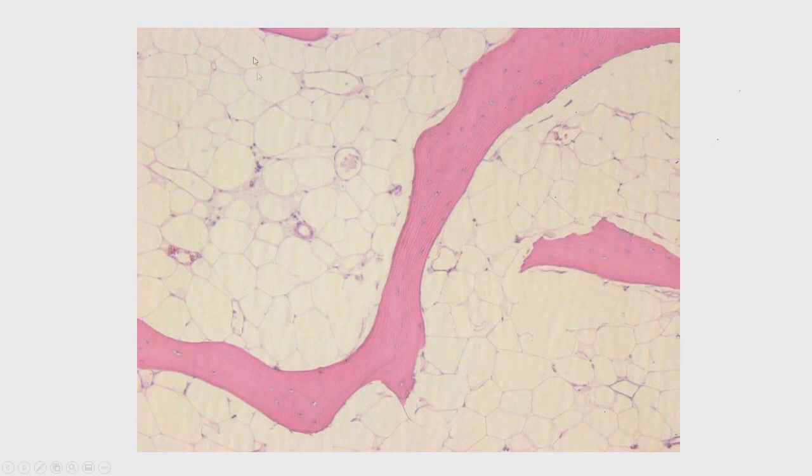You see the fat adipose cells, tissue around this island or this river or peninsula. Within this bone cell, you can see in the center here the layers of bone as it's laid down. They look like long patterns or long lines going through there. You can still see the nuclear staining, and so very delicate material. Very good microtomy that was done on this after the calcifying, and a very good optimal decalcification process.